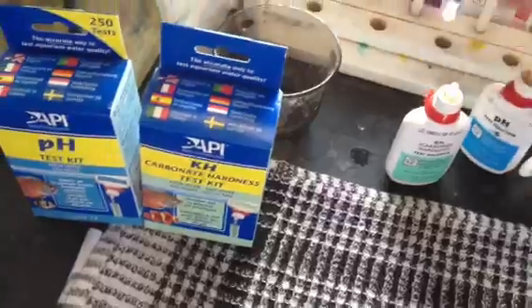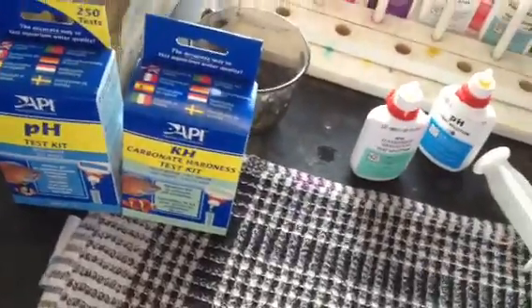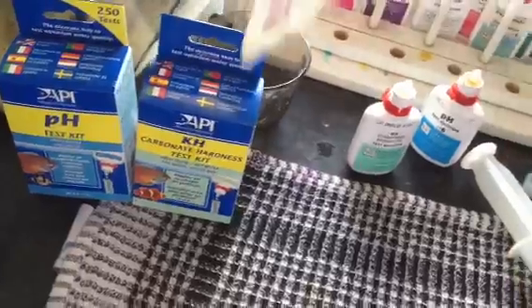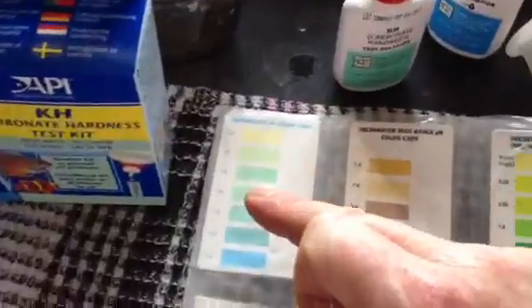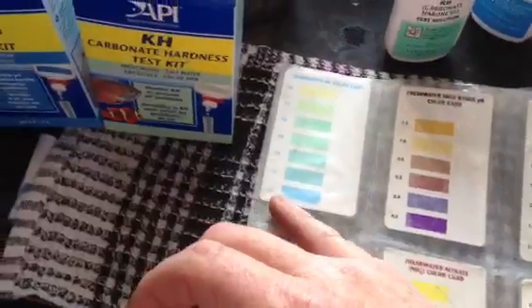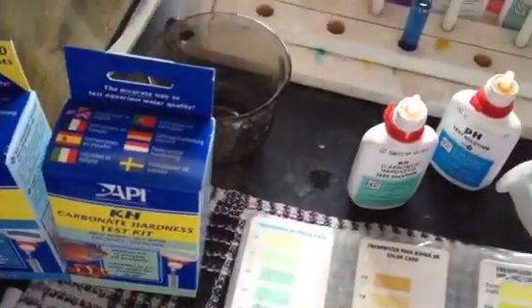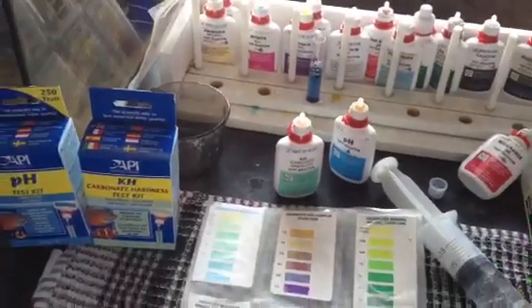So you put three drops in — one, two, three — then you shake it, and you just compare it to the color chart. Here's the color chart that comes inside the packet. You basically measure it up, and this is very blue, so that's 7.8 or higher. For most standard tropical fish, that's fine.